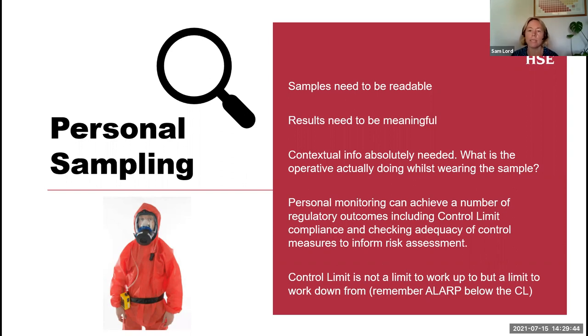As I said, results need to be meaningful. It's not just, oh, we've done personal monitoring, this is the result, tick. You know, what does that mean? Maybe it's because I'm an occupational hygienist, but I get really passionate. I want to know why. Why was that really high? Do you know why?